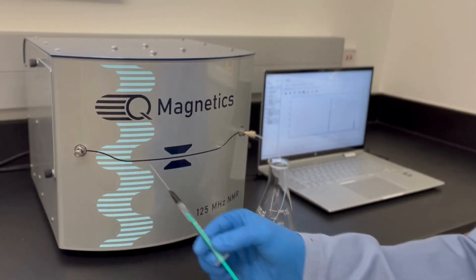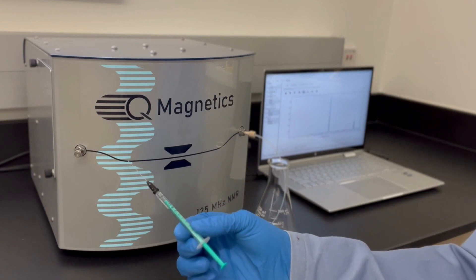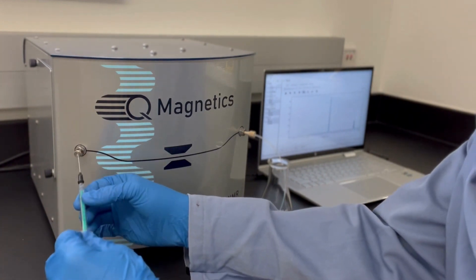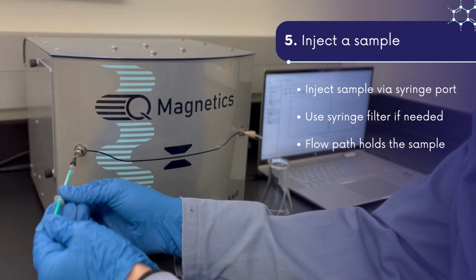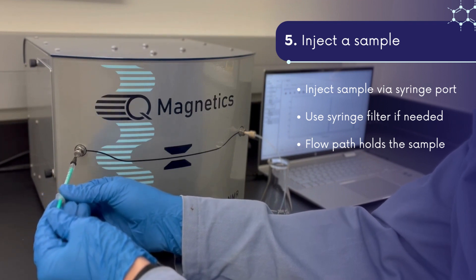Now we are ready to load our sample. Simply insert the blunt tip needle into the syringe port and inject the sample. If the sample contains suspended solids or undissolved material, use a syringe filter while injecting.